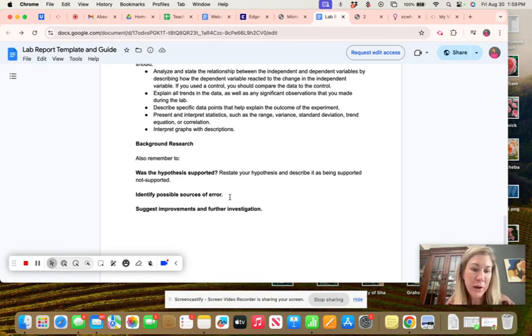For instance, in my experience as a chemistry teacher, we had a strip of magnesium metal tape, and what we were doing is we were going to heat it up and it's going to convert it into a different substance. The students had to coil that little ribbon up and put it in a crucible that we closed up and we heated with a Bunsen burner.